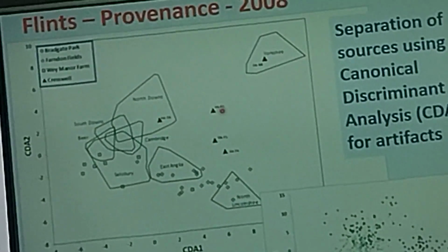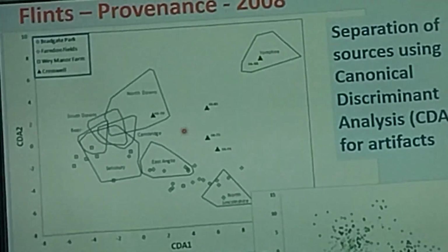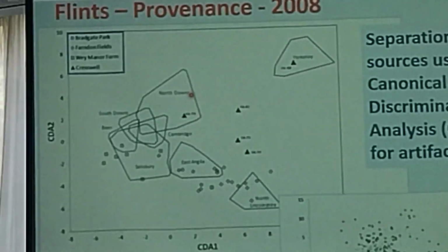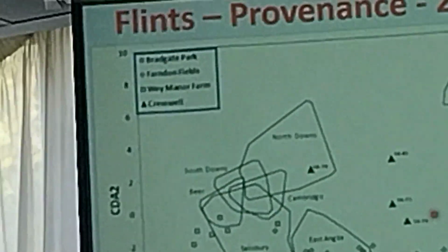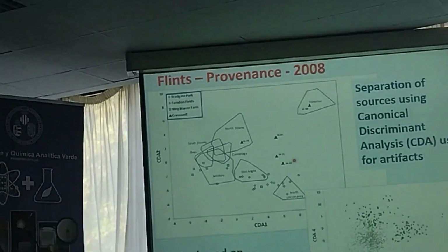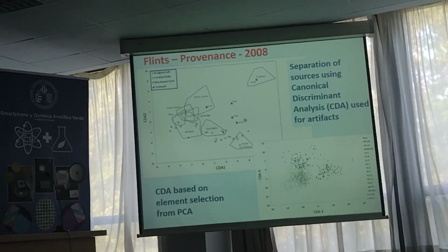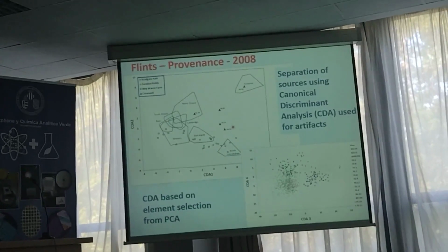And we can see here, really the easiest thing to see is that actually the Creswell ones do not match with any of the samples that we took. And, well, maybe this one does, but these don't. So although we sampled 8 or 9 regions, and within each of those regions there were 3 sites, it's still not enough. Maybe there were some exposures that the ancient man had that we don't have now.